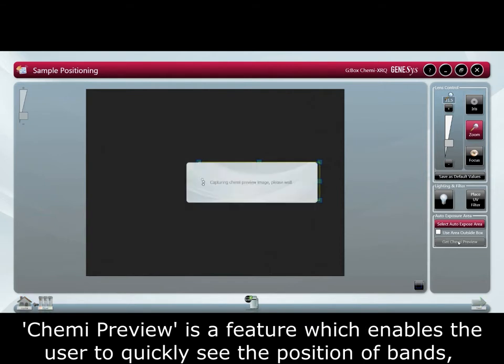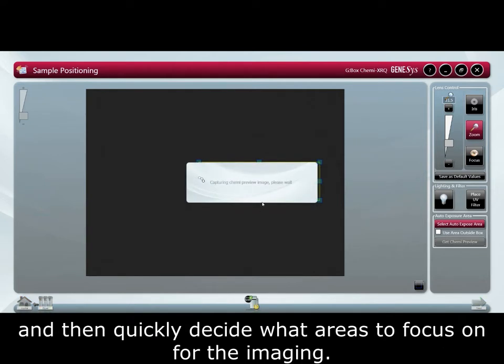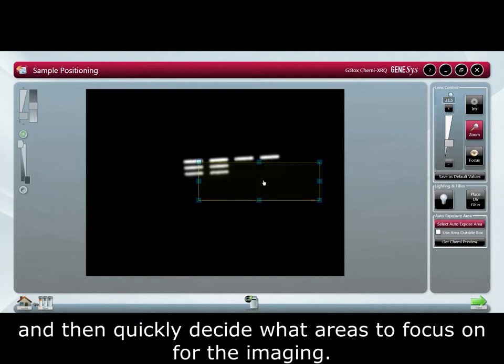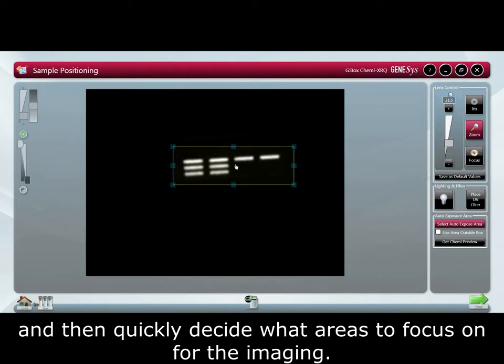Chemi preview is a feature which enables the user to quickly see the positioning of bands and then decide which areas to focus on for the imaging.